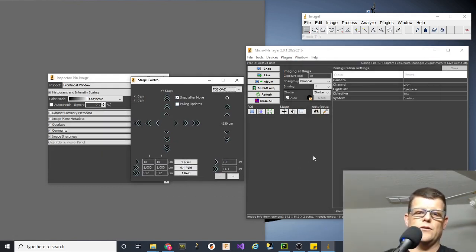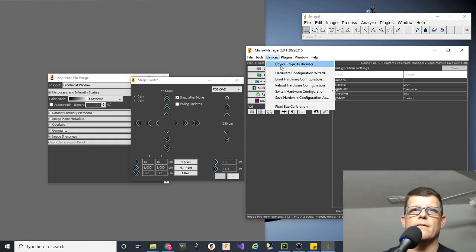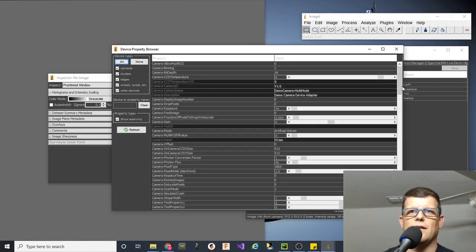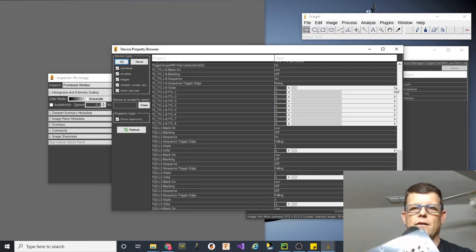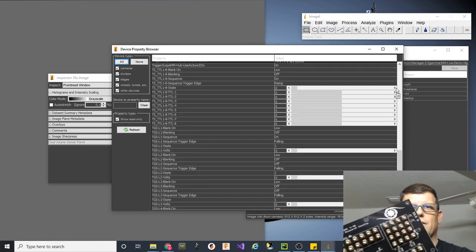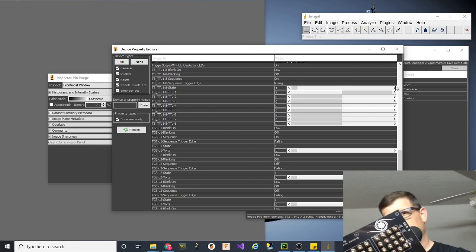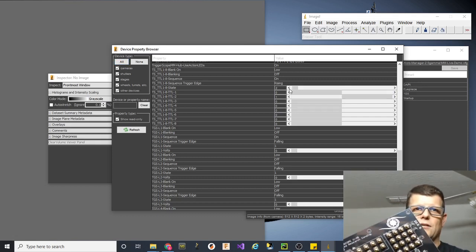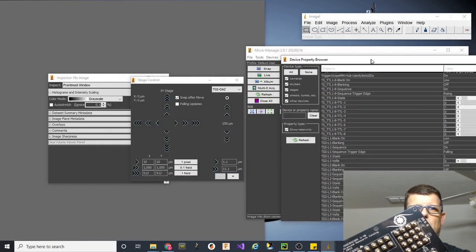So the next thing we'll do is bring our focus over to here, which is the TTL on-off LED. This indicates whether a TTL is active. You can see if I go to the device property browser and directly enable one of the TTL channels, let's go down here. Again, we'll just try to put that in the camera field. Okay, so my TTL channel is not on. And why is that? Most likely because my quote-unquote shutter is closed.